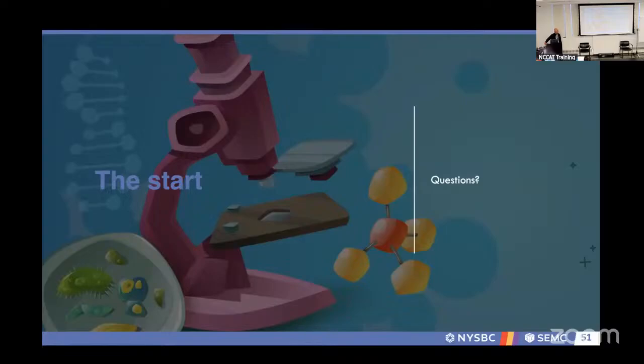Something I didn't really go into is that there's a mean free path of a couple hundred nanometers, and that's why we want a thin sample. So all that is projected into the same plane. There are different spherical aberrations that you can sort of account for, since you're not projecting the same plane.